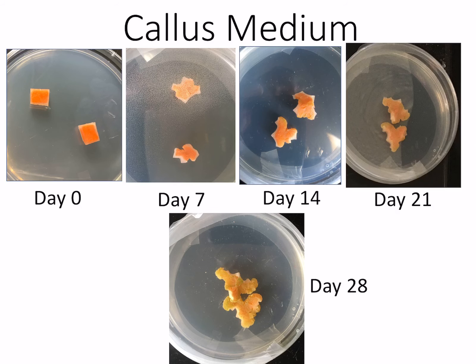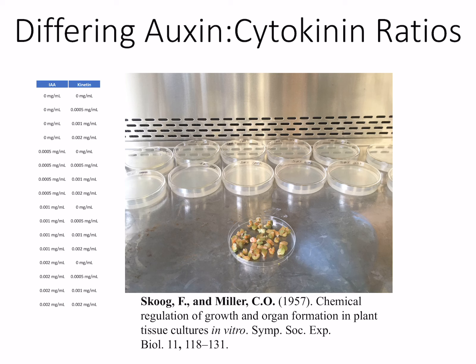Here's our progression of the callus from day 0 all the way to day 28, and we're just seeing growth — growth without differentiation into any type of organ.